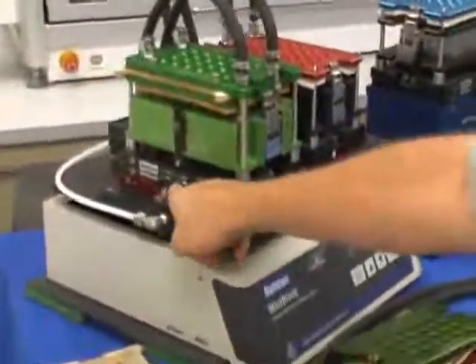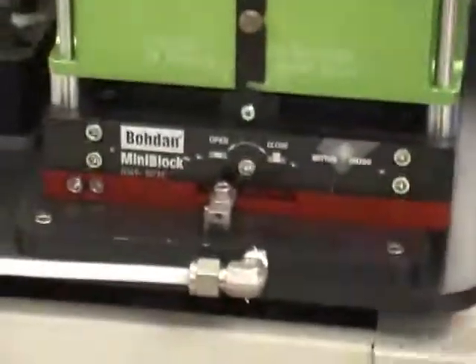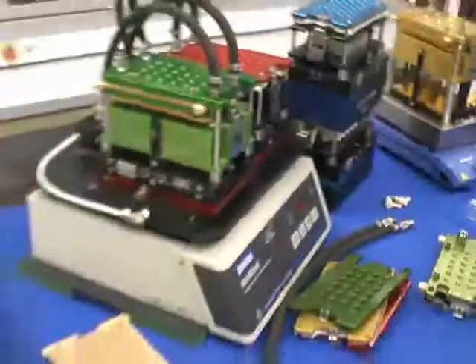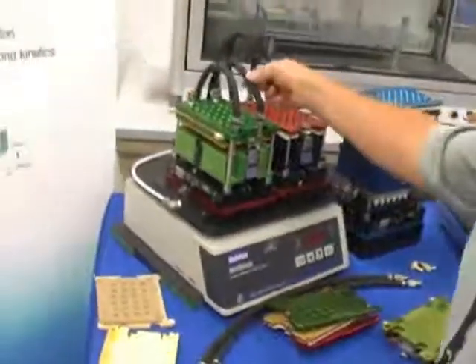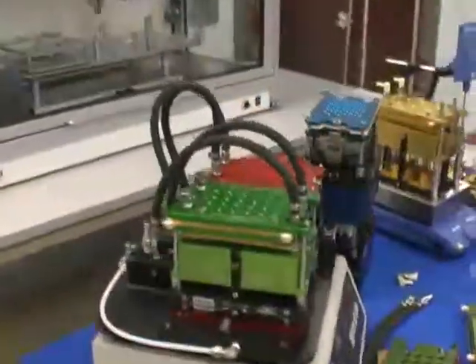You can open and close all the reaction vessels at the same time by simply turning this valve key right here. Mixing is by orbital shaking, which is the mini block orbital shaking station, and heating and cooling is done by recirculation manifold, which hooks up to a standard laboratory recirculator.